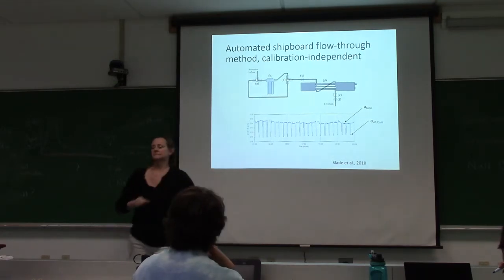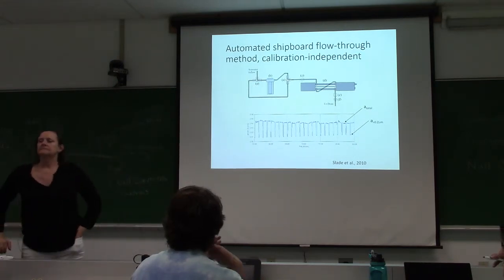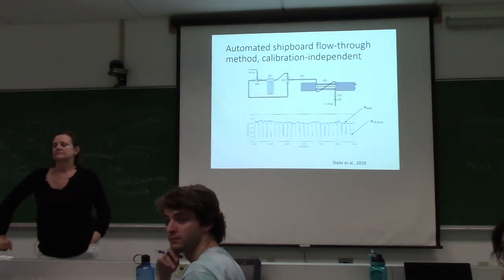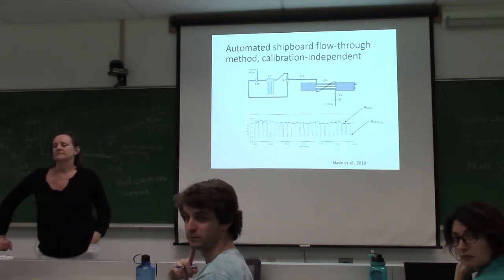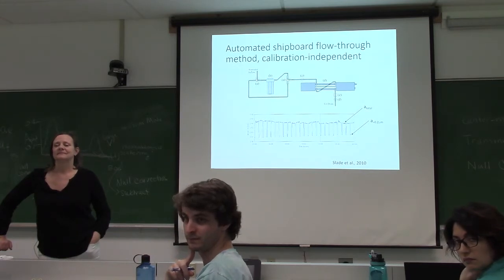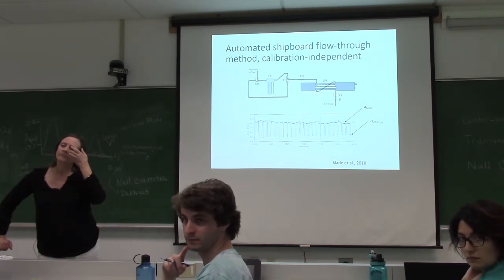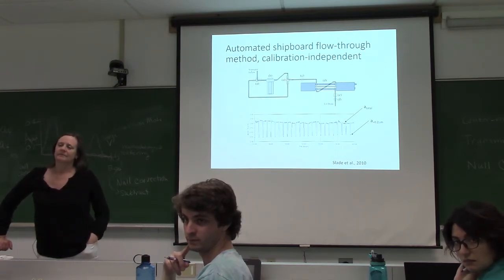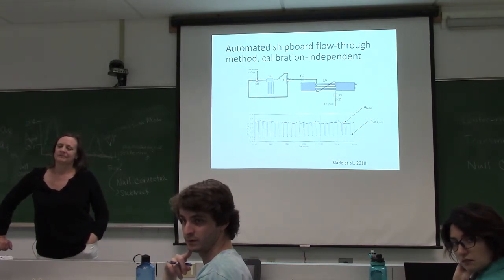So just one thing that I think everybody coming from this class should remember to do. So we talk calibration. There's something else you want to do every day with your AC meter. Once a day, you measure dissolved on all your AC meters. I don't care if you use two, one for total, one for dissolved. Once a day, the one you use for total, put a filter on. Why would you once a day measure dissolved on every one of your AC meters?